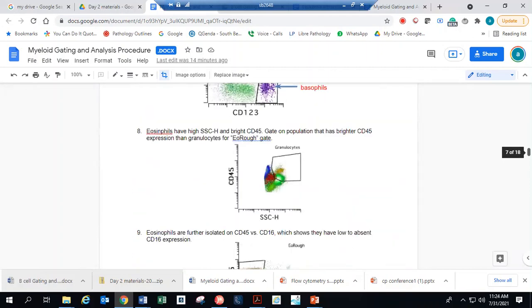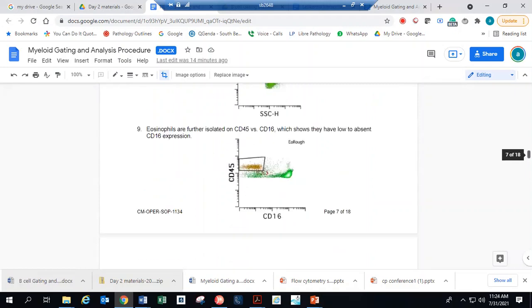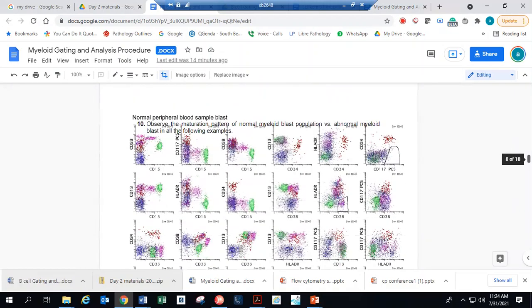So far, any questions, does this make things clearer as to how things will look in a normal one? Any questions? Jayashri, Rajeshwari, do you have anything to add? Are you here?